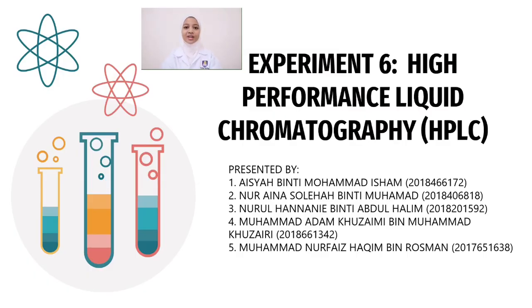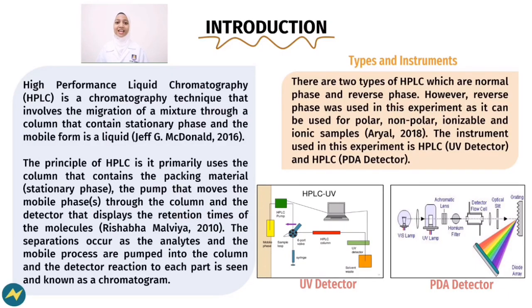We will present to you our next topic on case study, which is Experiment 6, High Performance Liquid Chromatography. Hi, so I will continue with the introduction.